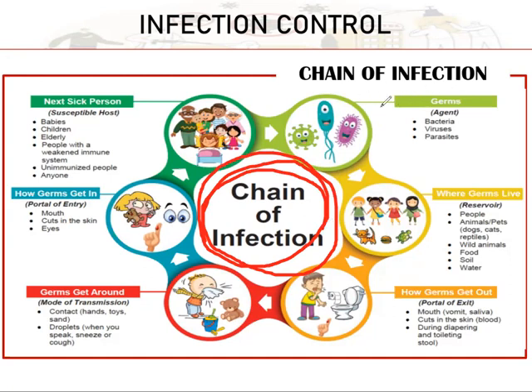So the first one, class, is our agent, or in layman's terms, germs, but since we are in the medical field, we term this one as pathogens. It can be bacteria, a virus, or a parasite. Depending on the type of the virus that harbors the condition, it has the capacity or potential for you to acquire a certain condition.